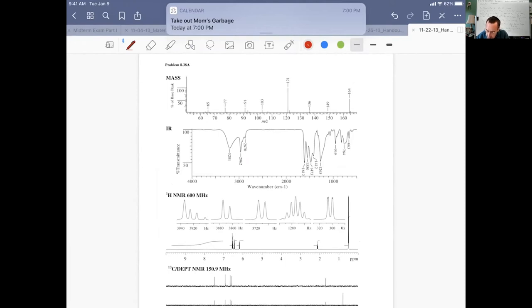If we look at our spectrum, this is our M+, it's an EI mass spectrum. In our IR, we see what looks like an OH group. It looks like we probably have an even number of nitrogen, probably zero nitrogen. We see a peak here at 1612. This could be a carbon-carbon double bond. It could also be maybe a carbonyl that's super conjugated. Let's go and take it through the rest of the spectrum.